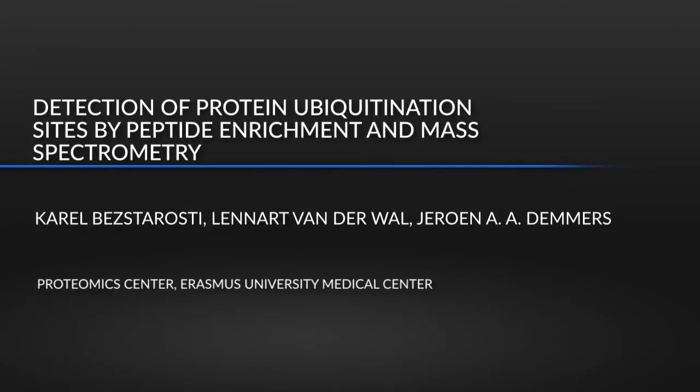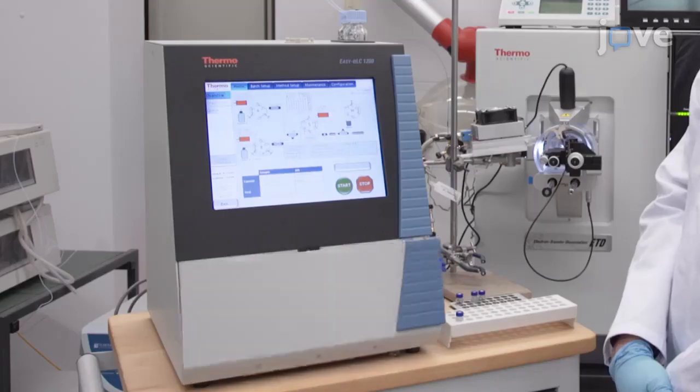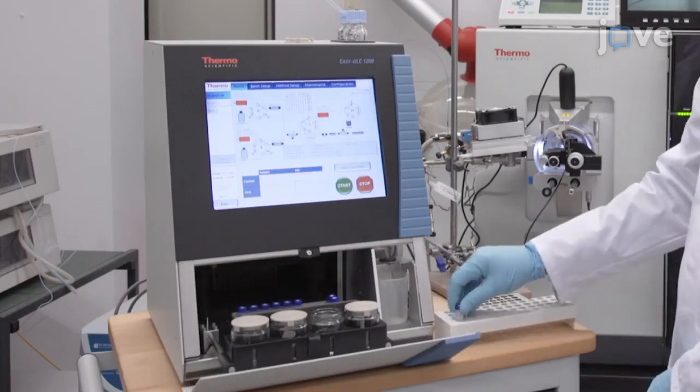The post-translational modification of proteins by the small protein ubiquitin is involved in many events in the cell. This study presents an original addition to the toolbox for protein ubiquitination analysis. We use enrichment techniques and mass spectrometry to uncover the deep ubiquitinome.